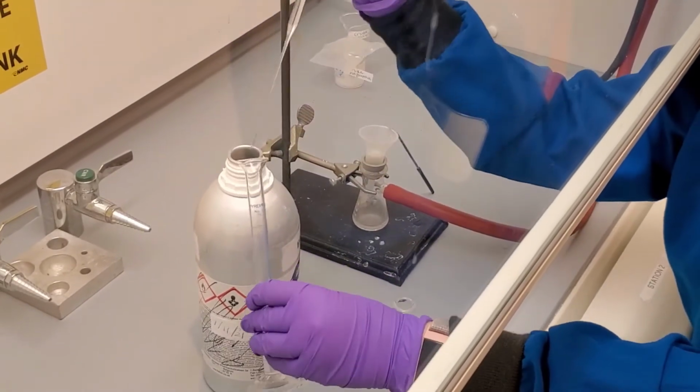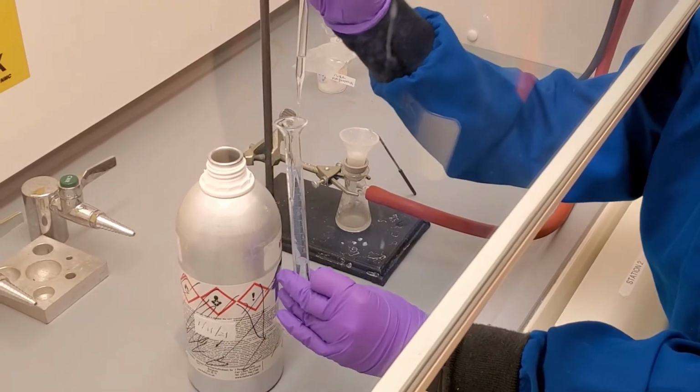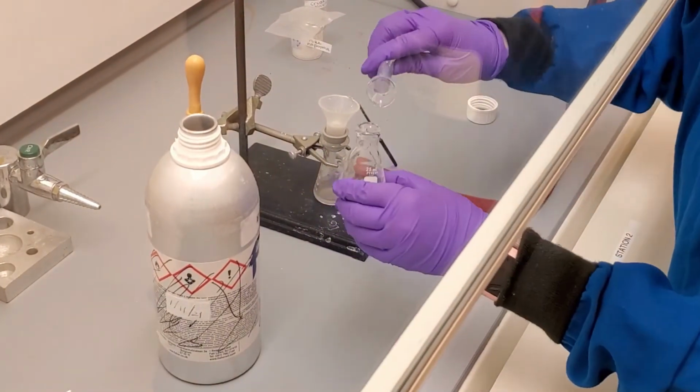Measure out 5 milliliters of diethyl ether in the graduated cylinder by transferring with a Pasteur pipette. Add the 5 milliliters of diethyl ether to the product and swirl to dissolve.